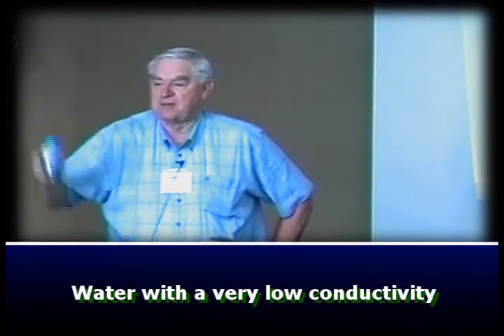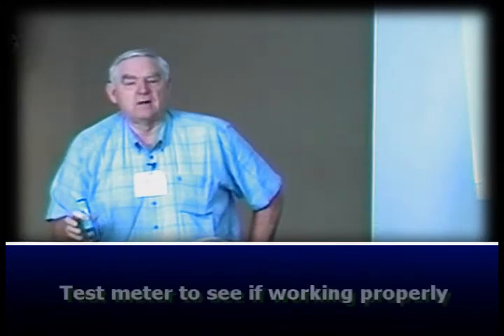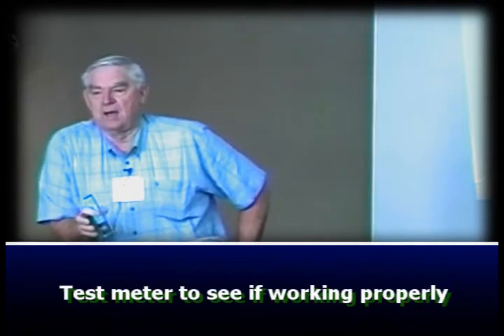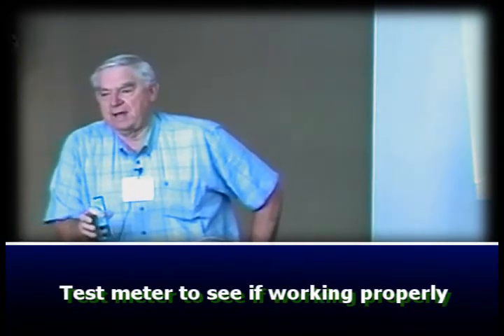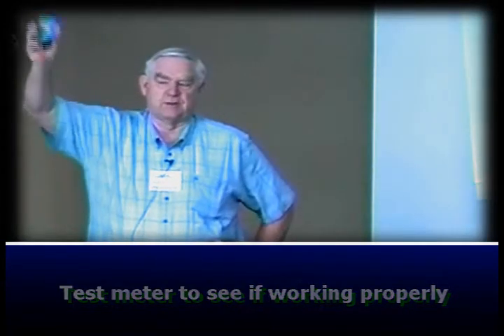I don't care where you get the water — the simplest thing is to measure it with a meter. Now, with every meter there are test solutions to test the meter and see that it's working properly through a certain range. This meter here is set up from zero to two thousand and has a digital direct readout.